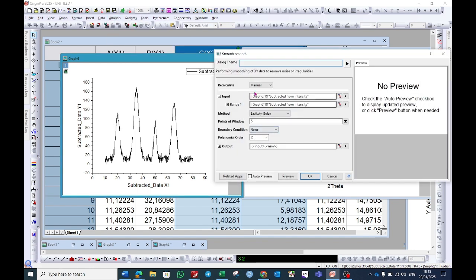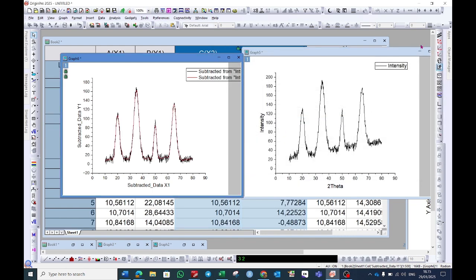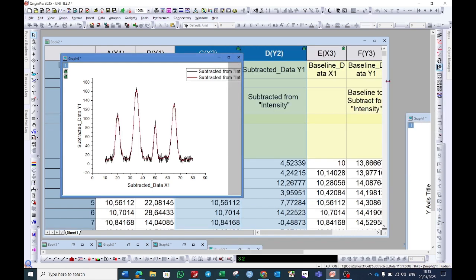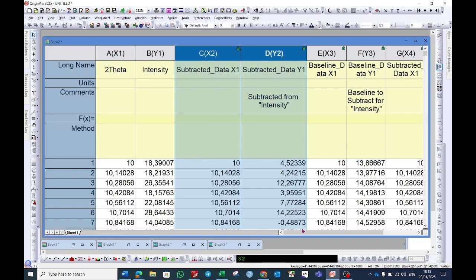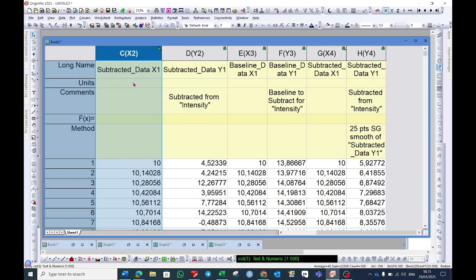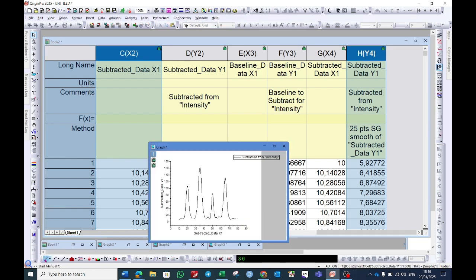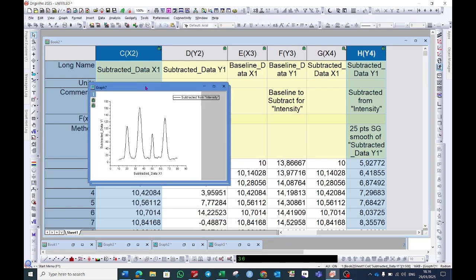In my another video, I have explained about the methods and about this point of window. You can watch this short video. Here I will choose 25 and then press OK. So it has generated another column with the smooth values. Select subtracted data X1, and this time the subtracted from the intensity, but with smooth data, the last column. And then select this line curve again.